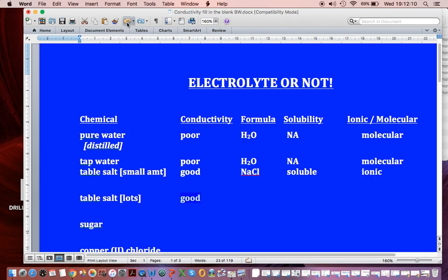And that was interesting. Lots of table salt. Well, I actually could say great. It was even better. And we have our NaCl, soluble and ionic.